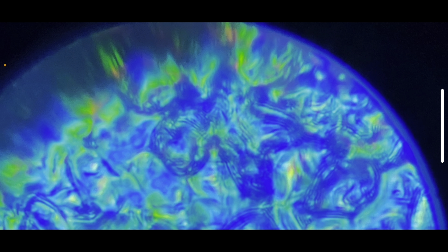We can do some research to see what we're seeing. Maybe this one is telophase — you can see it's bounded by a green wall, which is the original cell's membrane or cell wall, but now you can see the cell is trying to separate into two. Some chromosomes are going to one end while others are going to the other end. Overall this slide is so far the coolest — well, they're all pretty cool. Leave your thoughts in the comments below!